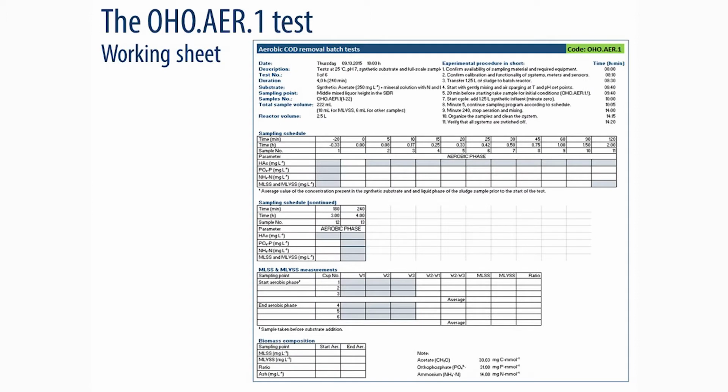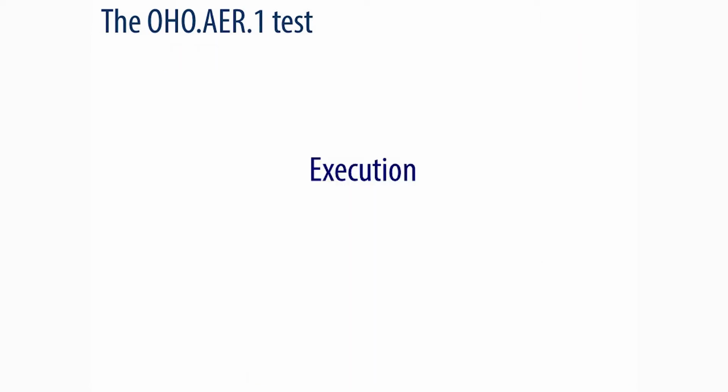To carry out the test, it is highly recommended to prepare a working sheet. The working sheet should summarise all the steps that need to be followed before, during and after the execution of the test. The working sheet should also include the sampling times, as well as relevant information regarding the analytical parameters that need to be determined with each sample.